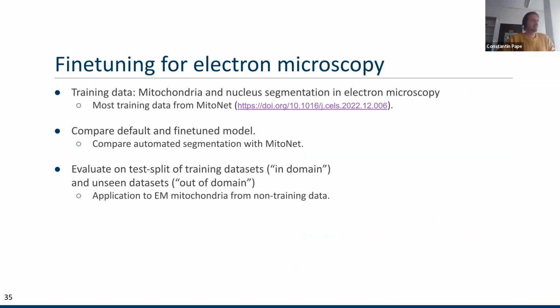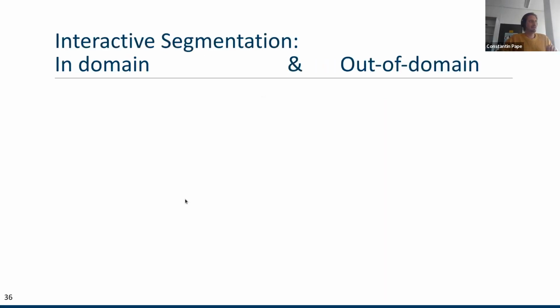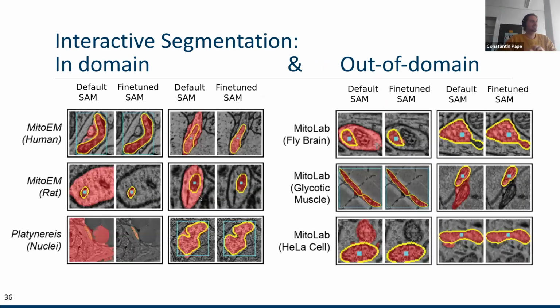The overall approach here was fairly similar, just to say that here we profited a lot from the MitoNet publication from Kedar Narayan, who actually went through all this trouble of collecting a large data set from different sources already. So we used this for our training data, and then used additional data sets also from their publication to test the model.